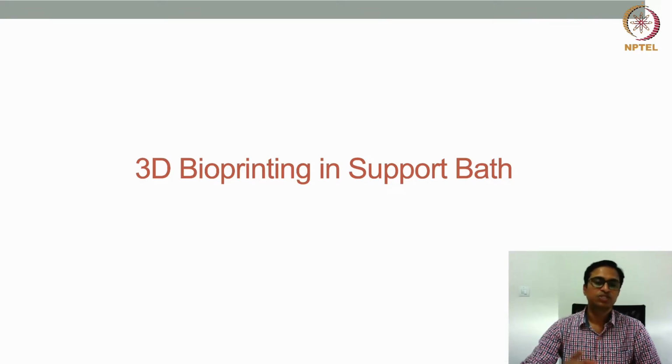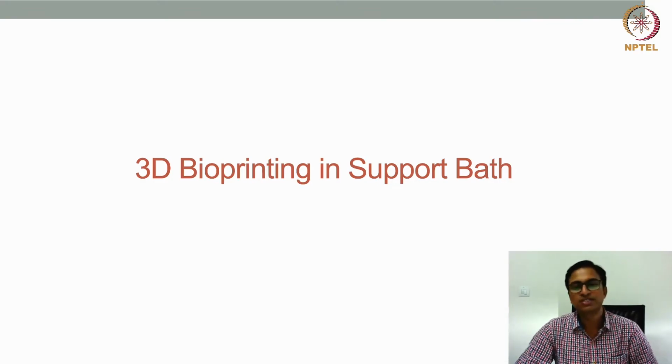So that's why mostly we use low to moderate viscous bio-ink. So in this lecture we'll discuss a recent development on this bioprinting technology, that is 3D bioprinting in support bath. So we'll see why this last two words, support bath, is important. What is the purpose of the support bath, and why we need a support bath basically.